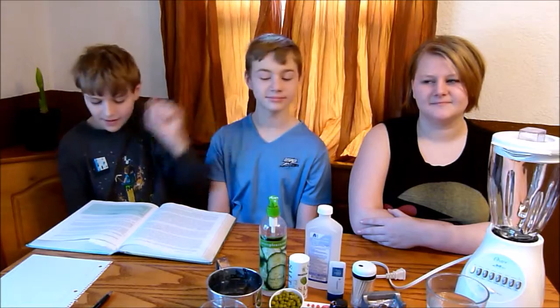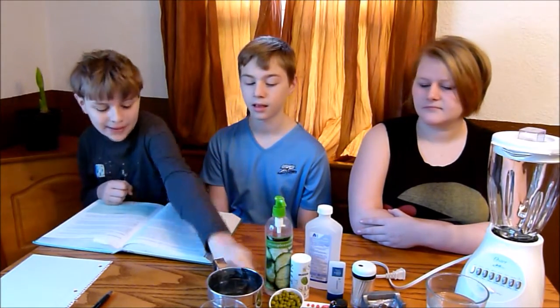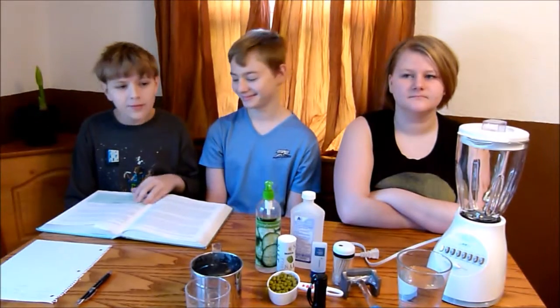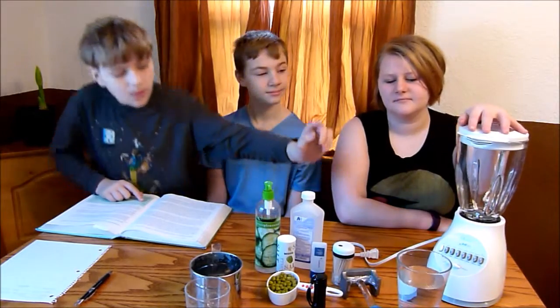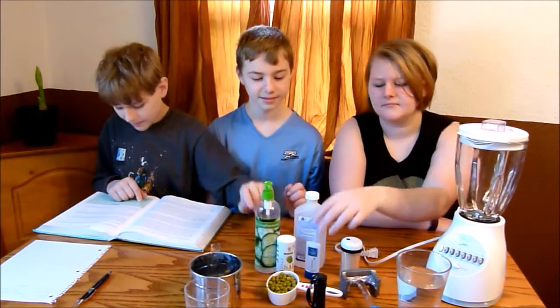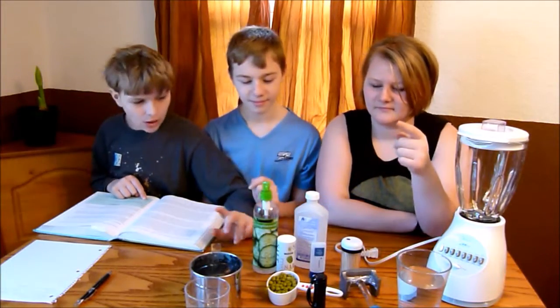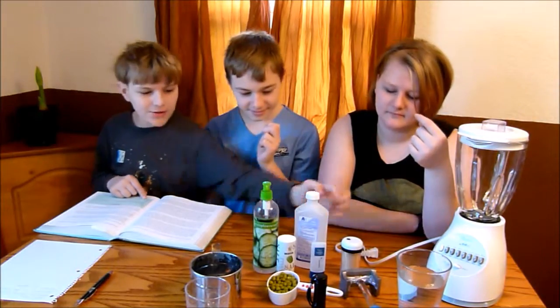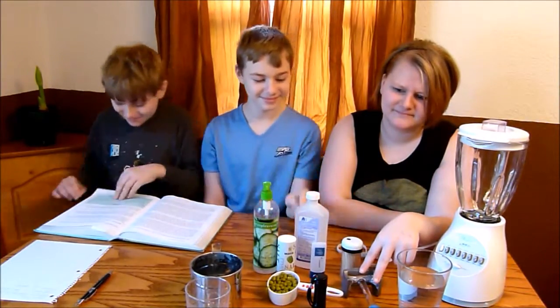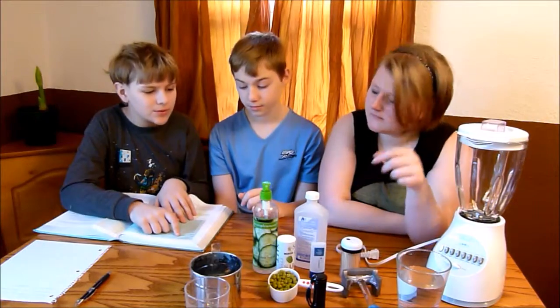Hi, it's 8KidsPlaying here featuring Tyler, Ethan, Katelyn. We're going to be doing the Apologia Biology Kit Experiment 7.1. We're going to be extracting pDNA. We have all our supplies here: our blender, toothpicks, hand soap, salt, water, strainer, small glass, meat tenderizer, rubbing alcohol, half a cup of sweet peas, measuring cups and spoons, and a flashlight.